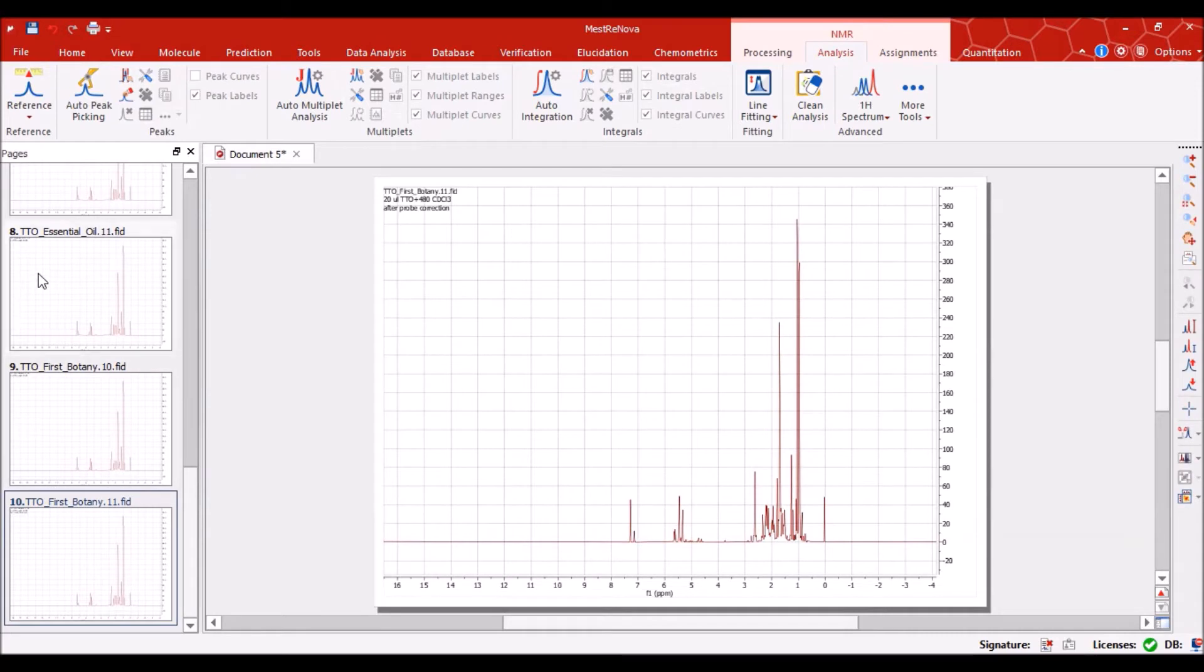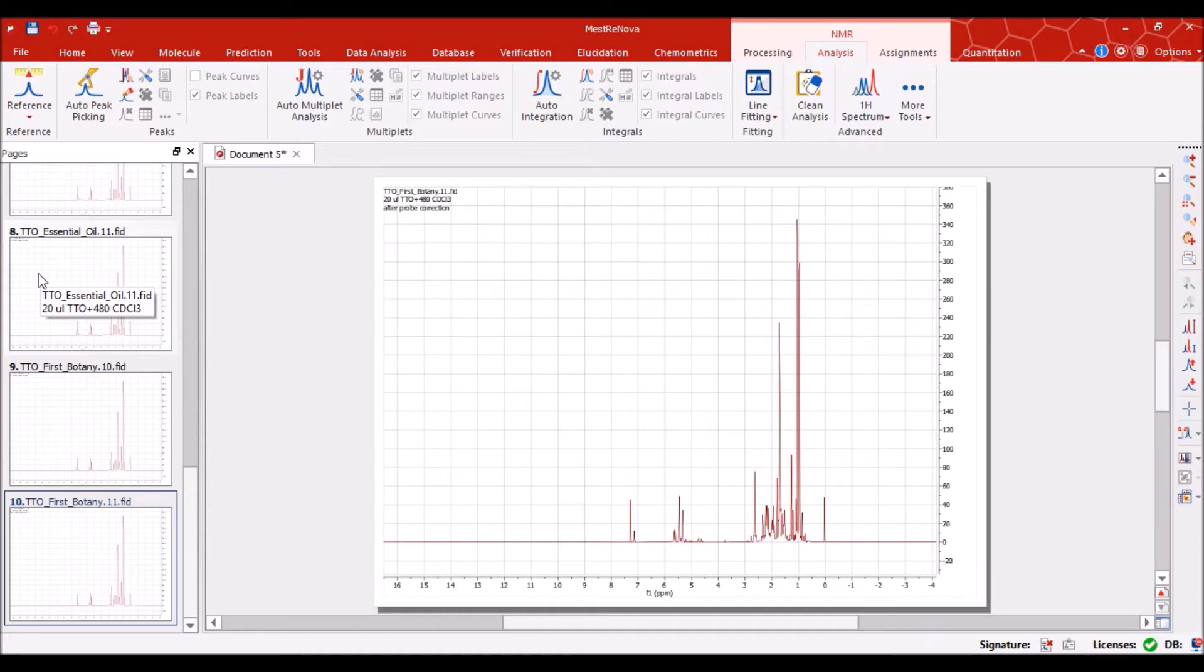So in total I have opened 10 spectra. This can be 20, this can be 100. Just for an example I have opened 10 NMR spectra.